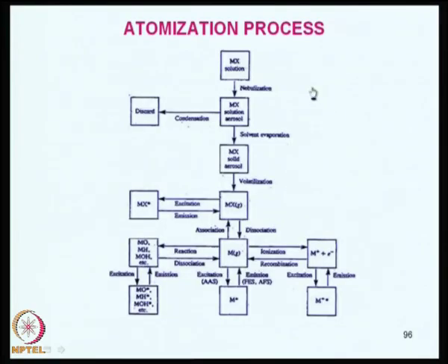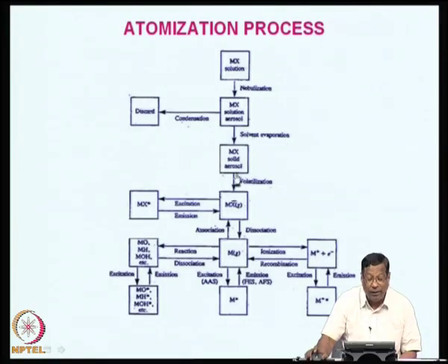So, what happens in the atomization process? Very interesting situation. Here in the middle region, I have MX, that is metal halide solution. You start from basically a solution which is to be analyzed, that is at the top box.